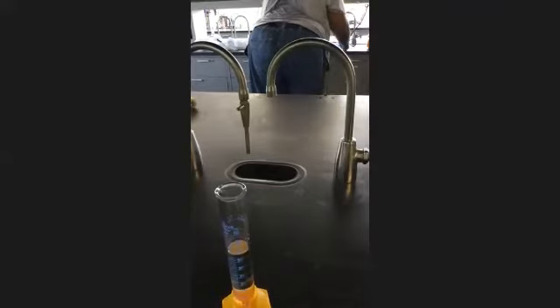All right, so we're gonna put that on an ice bath because the water needs to be cold, because what you wanna do is shock the aspirin out of solution. What do we do once this is done? You can take it off and sit it on the bench top. Just take the whole flask out, and once the water gets cool, we're gonna dump it in. I'm gonna put the water on ice.